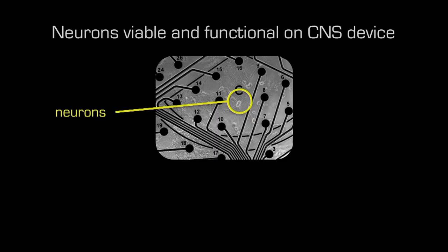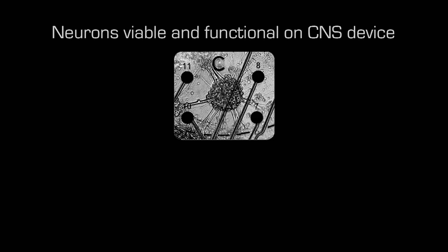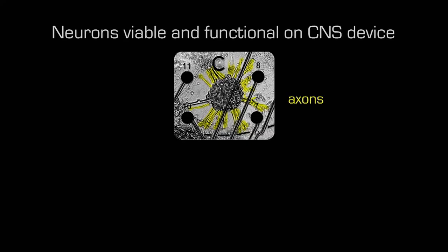And so what does it actually look like on our device? This is an image from a microscope. And you see the lighter splotches in the image are actually the neurons growing on and around the electrodes. And if we zoom in a little bit, here's an example of some neurons closer to the electrodes. We see different clusters of neurons. And if we look closely, we see that these lines extending out, those are actually the axons that Heather talked about and that we modeled with our student neuron.